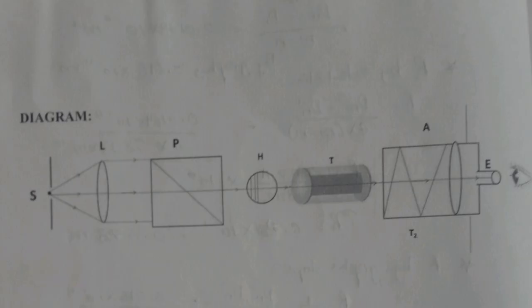The theory behind the experiment is very simple. When plane polarized light passes through the sugar solution, you might question how the light is plane polarized when it's coming from a simple sodium vapor lamp. Firstly, the polarimeter collimates the light, that is, makes it into parallel beams of light, and then it passes through a Nichol prism, which converts it to plane polarized light. Then it's passed through the sugar solution where it gets rotated, and then through another Nichol prism which helps us analyze the rotation caused.